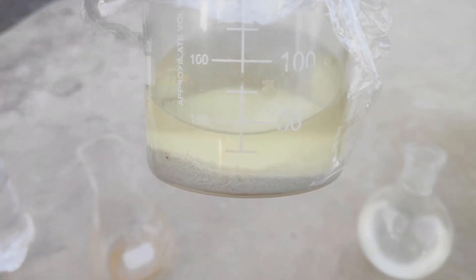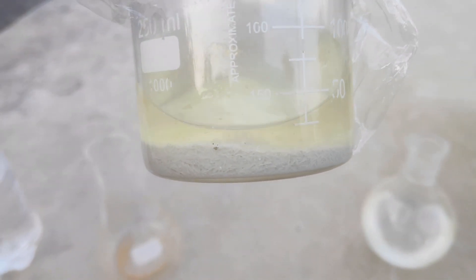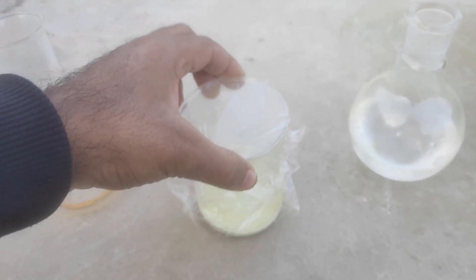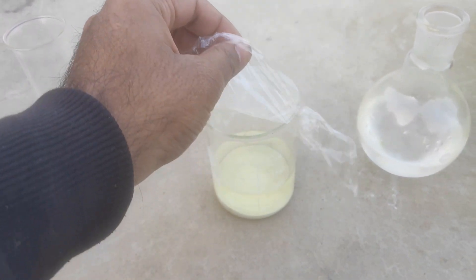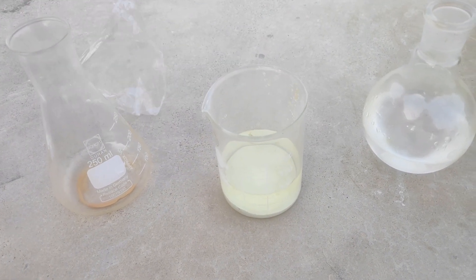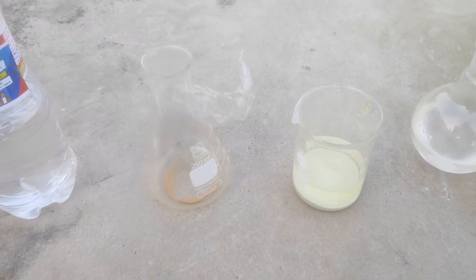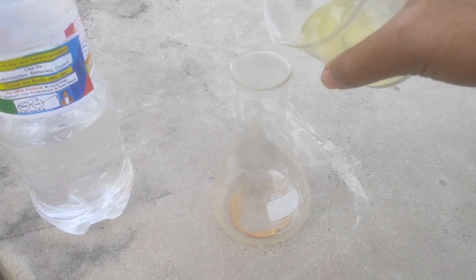Over here, my friend has obtained some metastannic acid from the reaction of tin with nitric acid. This metastannic acid needs to be washed, decanted, and filtered. The washing step allows you to isolate pure metastannic acid, which must be done in order to get a clean product. You need to first wash it with dilute nitric acid, then with water.